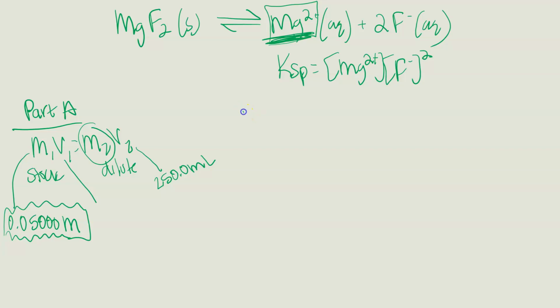So it's been a little bit. ppm stands for parts per million. It's one of the concentration units we learned back in the beginning of the semester. And there are two ways to solve for ppm. You can get the milligrams of the chemical you're looking at, which for us is magnesium, divided by the liters of the solution, or you can take grams divided by grams times 10 to the 6th. Well, we're making a solution in a volumetric flask, which means we're going to know the milliliters. So the milligrams per liter is going to be more useful for us. So you're getting the molarity by doing M1, V1, M2, V2.